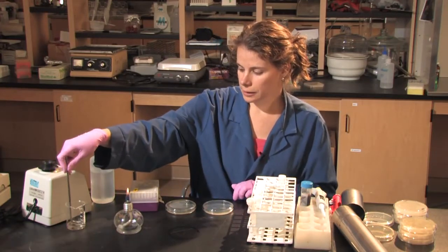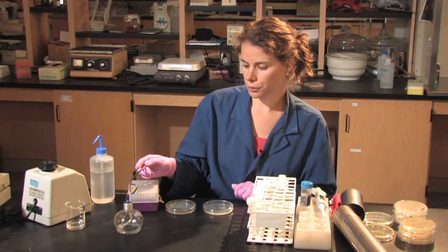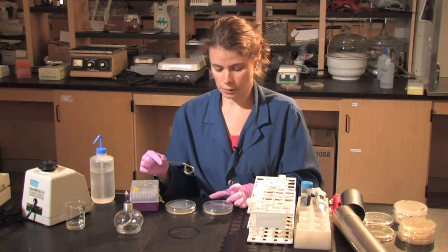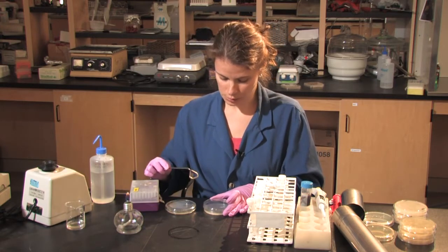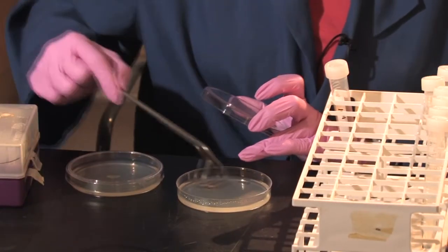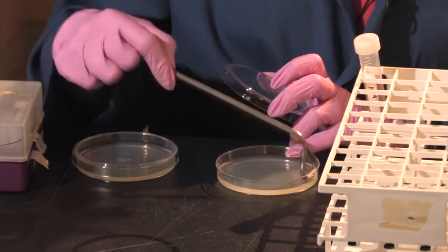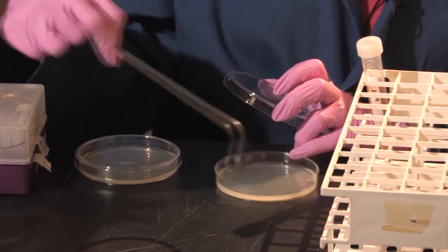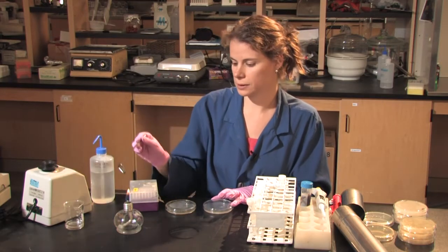I have a spreader here in ethanol, and I will put it through the flame. This burns off the ethanol and aseptically sterilizes my spreader between samples, so that I don't have any contamination between samples or from outside sources. Once my spreader has cooled, I will put it through the 100 microliters of solution, distributing it evenly across the plate.